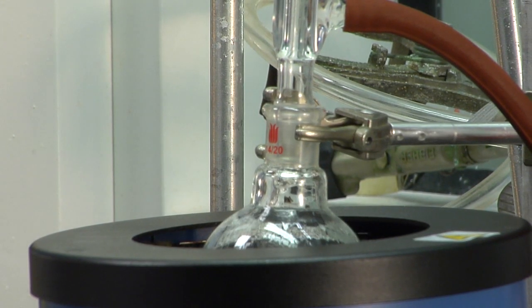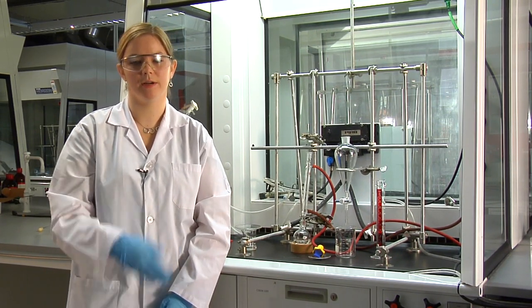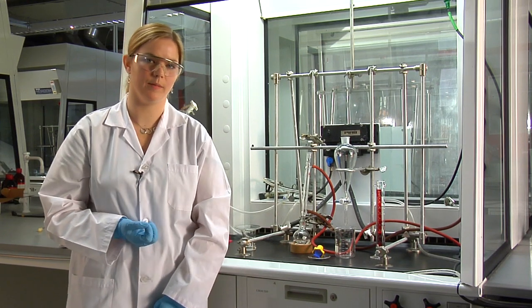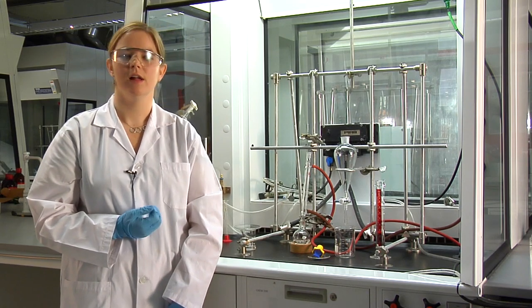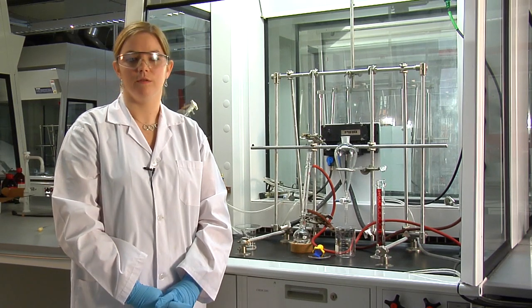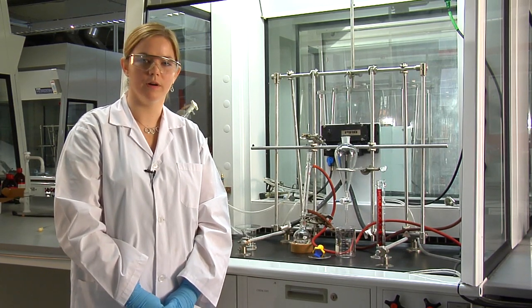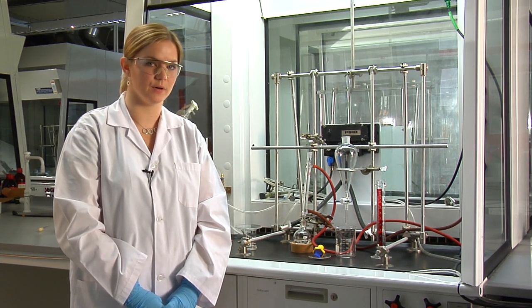And so now that you have this going, you're going to wait 1 hour until the reflux is done. That will ensure that the reaction has gone to completion, and then we're going to show you how to isolate this compound. So once you've been refluxing for about an hour, you can remove your heating mantle by dropping the ring clamp down and removing the heating mantle, and then you just let your solution cool down to room temperature or close to room temperature, and then we're going to be doing a liquid-liquid extraction in order to isolate your compound. You have seen liquid-liquid extraction before in an experiment from last semester, so you can re-watch the video there to remember how it goes.